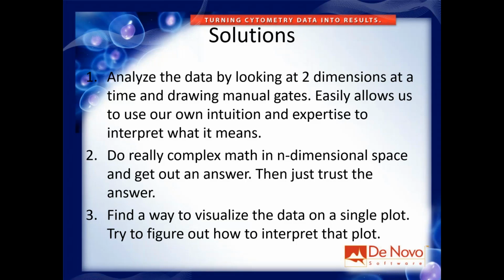Okay, so I'm certainly not going to say that these should be disregarded or that they're not useful. They're absolutely critical. They allow you to use your own biological knowledge and your intuition, and again, they're the only ones that show data in a biologically meaningful way. But there are other tools that might be able to help as well.